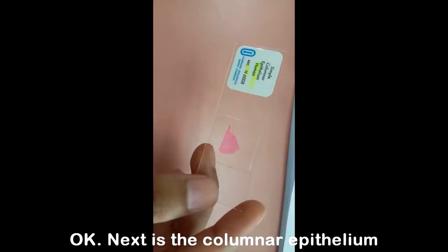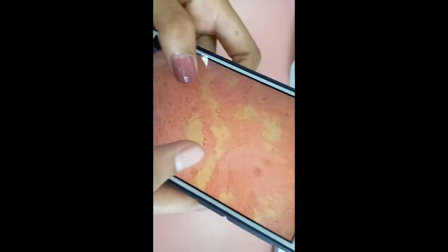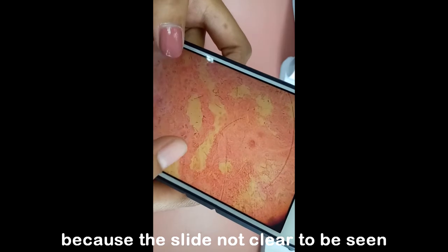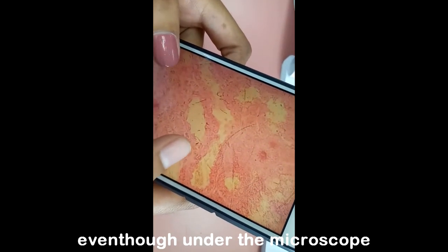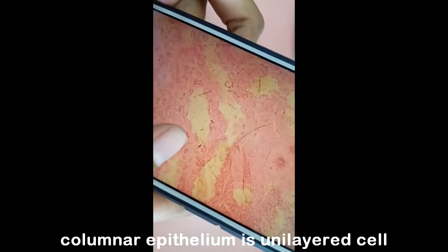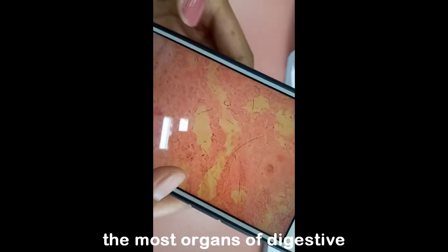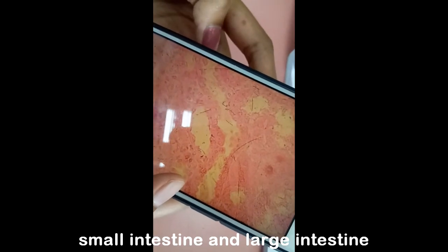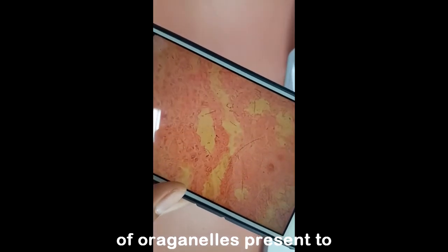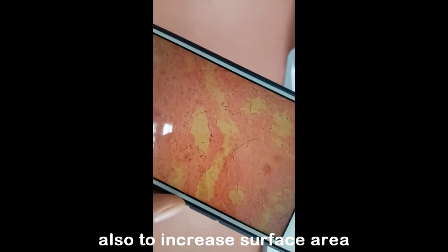Okay, next is the simple columnar epithelium. This is the picture. We can't see the columns clearly because the slide is not clear even under the microscope. The columnar epithelium is a single-layered cell that lines most organs of the digestive tract, including the stomach, small intestine, and large intestine. Its function is to increase the amount of organelles present to synthesize needed material and also to increase surface area.